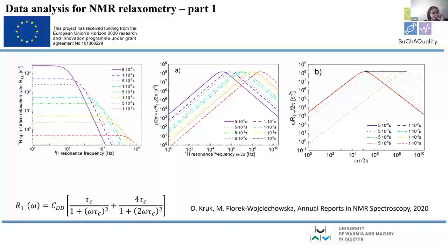So here the mechanism of motion, which in this case has been assumed is described by an exponential correlation function, gives this form of spectral densities. So this is the story behind this formula. And you can clearly see that it is far from what we observe in real systems. Okay, if this is clear, I would like to show you something.